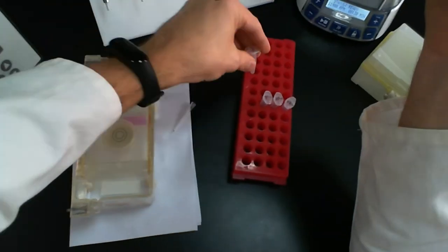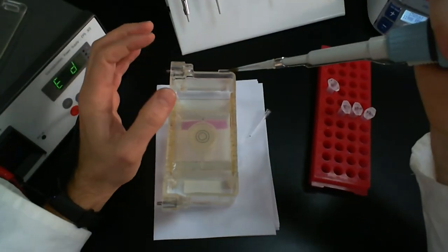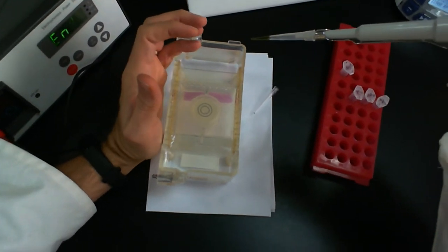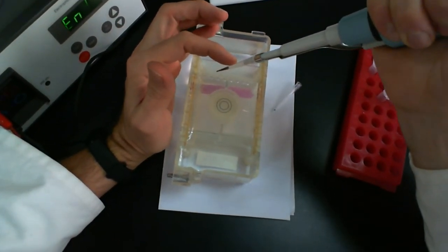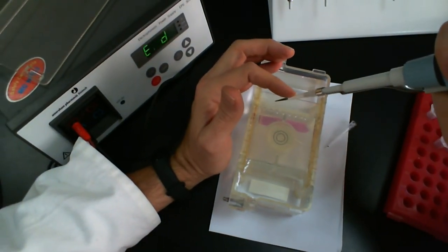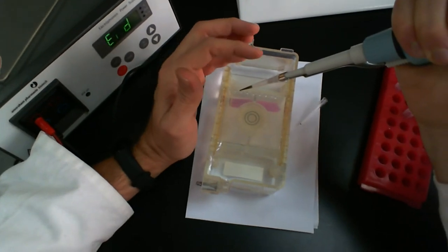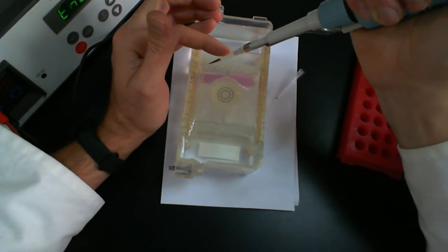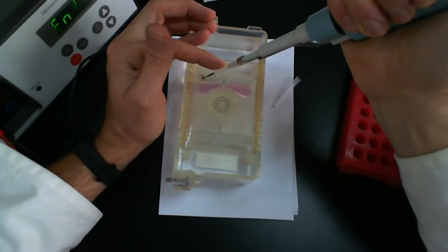Exactly 25. And so the trick to loading a gel properly is to make sure that you're using both hands. One hand is planted, so I usually have it on the bench and have my fingers up against the side of the gel apparatus. I'm going to use my finger to help guide my tips, otherwise your hands are going to shake. So always have one finger close to the tip, and it's going to guide your tip into the well. And so right there, I'm in the well now.